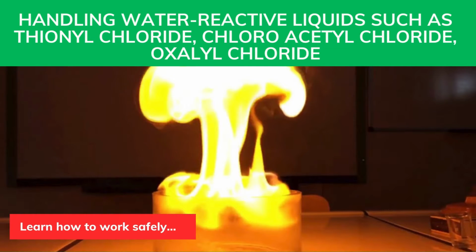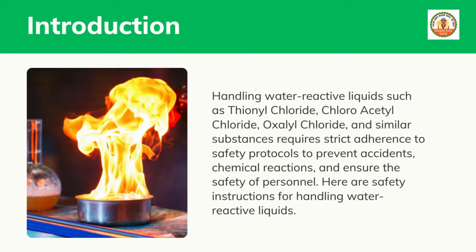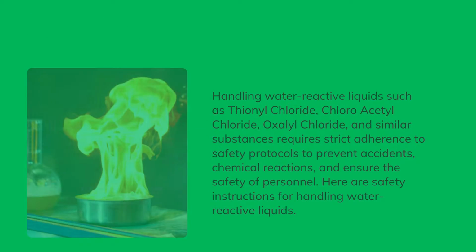Water-reactive liquids such as thionyl chloride, chloroacetyl chloride, oxalyl chloride. Handling water-reactive liquids such as thionyl chloride, chloroacetyl chloride, oxalyl chloride, and similar substances requires strict adherence to safety protocols to prevent accidents, chemical reactions, and ensure the safety of personnel. Here are safety instructions for handling water-reactive liquids.